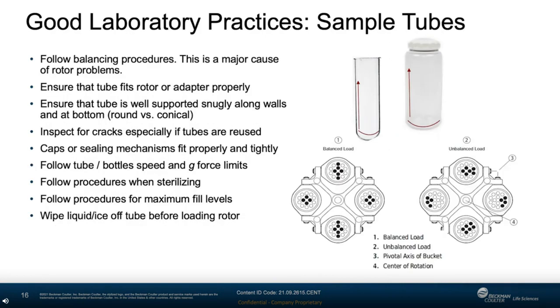Tube selection is complicated because there are so many options. Make sure you're using a tube appropriate for the intended use. The tube should fit the rotor. And this sounds obvious, but the force of centrifugation doesn't allow for gaps or movement with ill-fitting tubes.